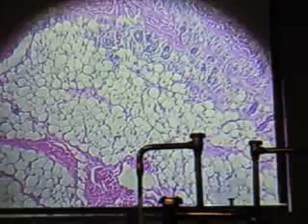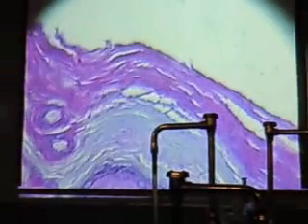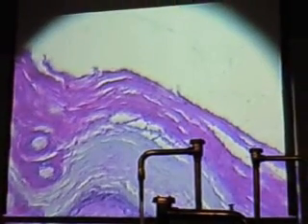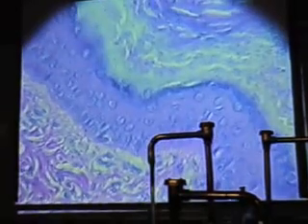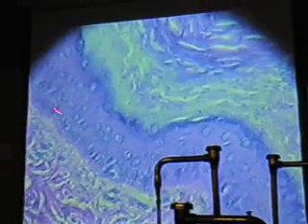Adipocytes. Okay. So if we come back, and then we're going to put this on. Don't see any nuclei up there. If I ask you, 3 words that name this epithelium, what are the 3 words? Keratinized, stratified, squamous. Okay, this is the free space. If we continue to go down into here, what's that right there? Basement membrane.